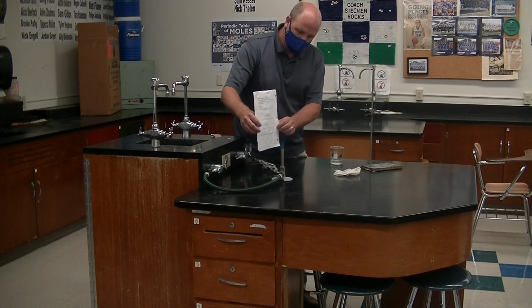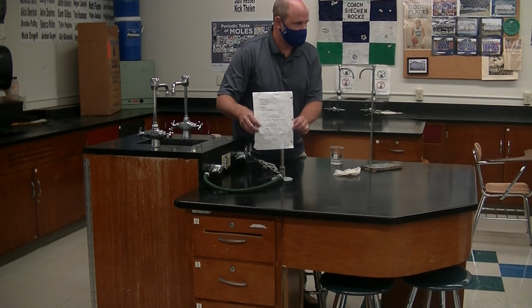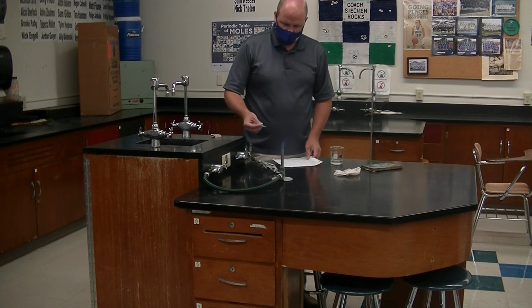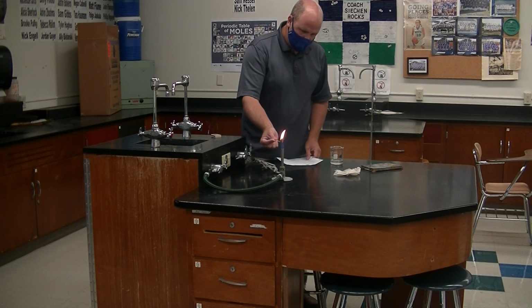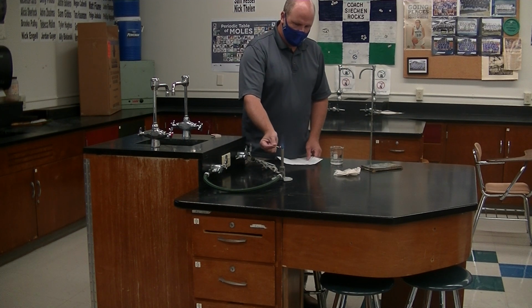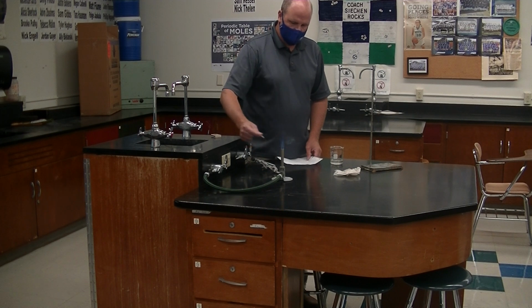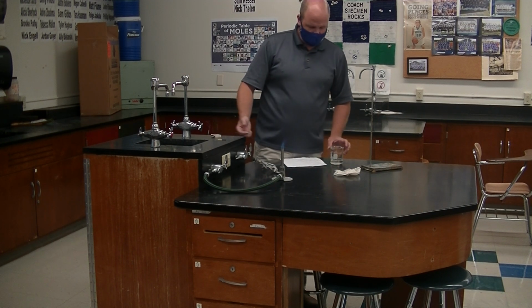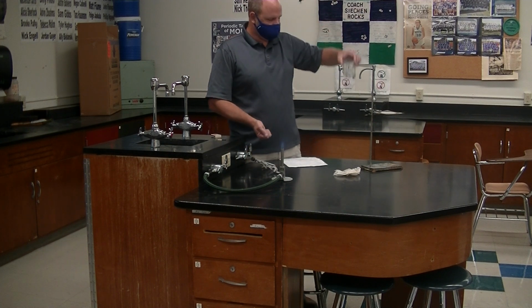Can you see that there's two cones? Can you see an outer cone and an inner cone? The hottest part of the flame, and I'm going to stick this back in here, is the tip of the inner cone, right in there. Not down here. It will get caught down there, but not as well. And way up here is not really the hottest part of the flame. So we're going to use this to heat up some water in the beaker.